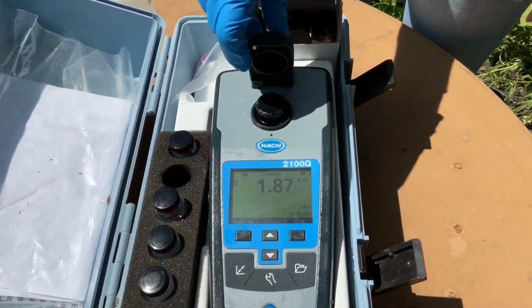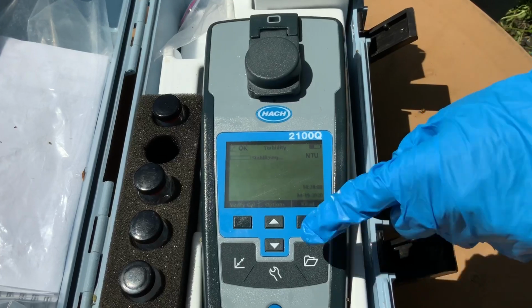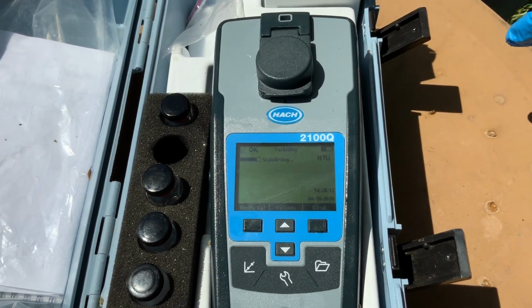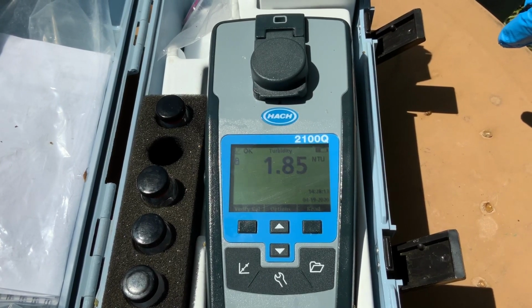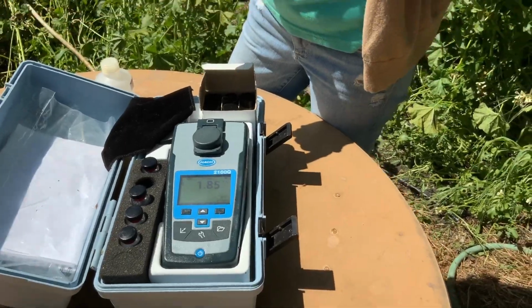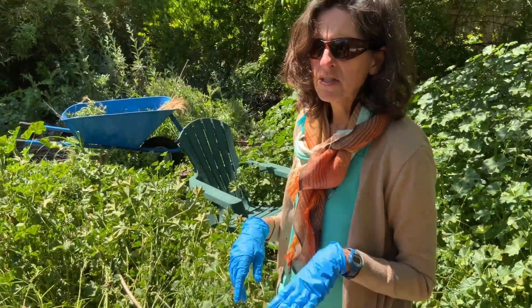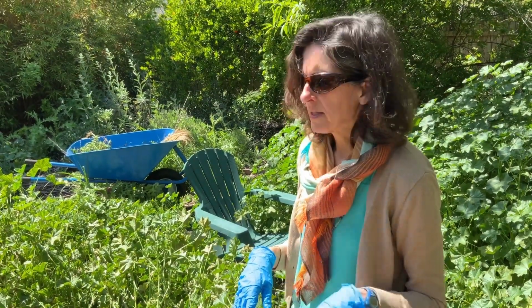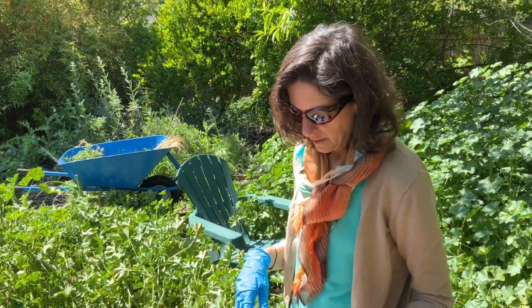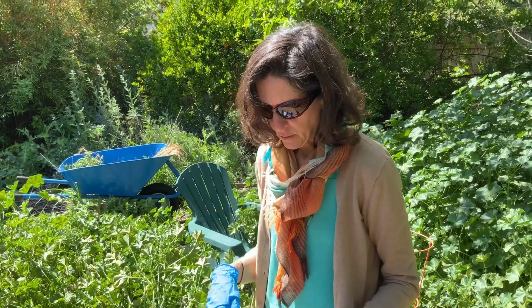Turn it back here again. 1.85. So I probably would do one more if I were doing this for real, just to make sure. It could have been that the first one was a little bit off for some reason, and that these are getting closer. So that's pretty much all there is to it.